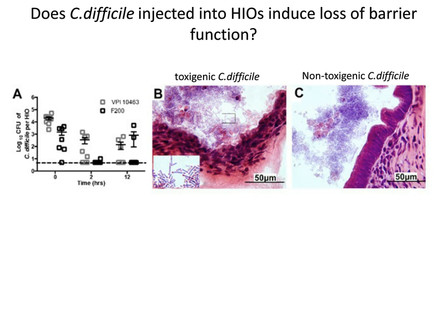In contrast, if you look at panel B, you can see that the bacteria are present, but the epithelium is completely gone. So this epithelium has, at this point, after about 12 hours in culture, already undergone such severe injury that the cells have completely lost their adhesion to one another. They've rounded up and sloughed off and have undergone cell death. And so, again, the conclusion here is that injected Clostridium difficile also induces massive damage to this epithelium.